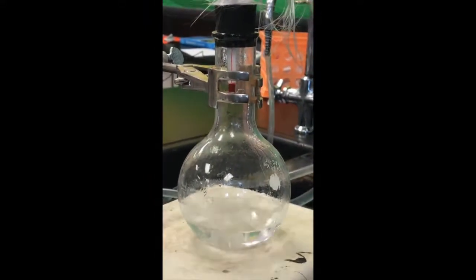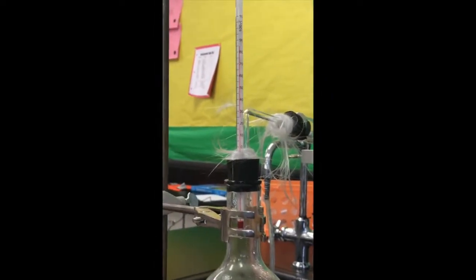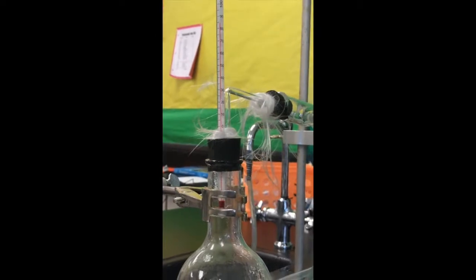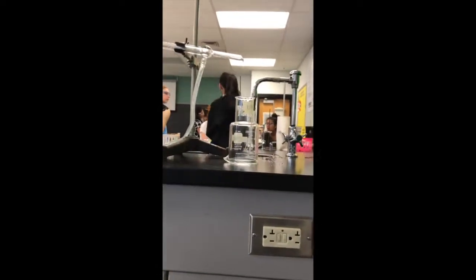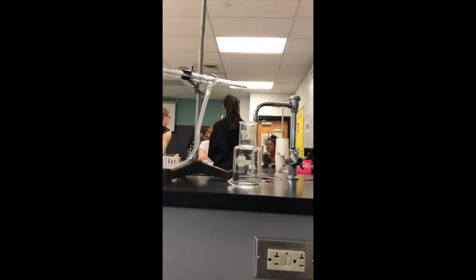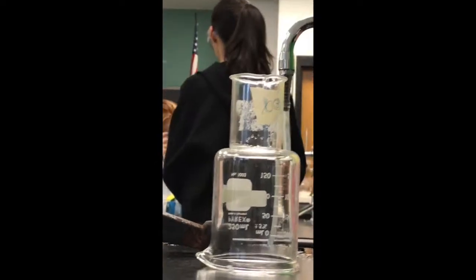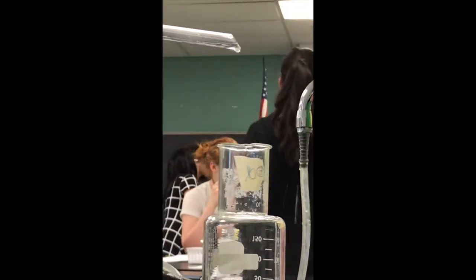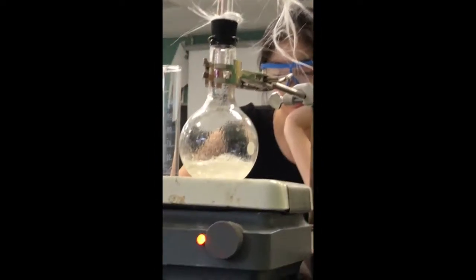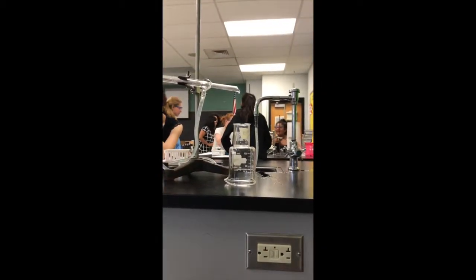We repeated this process for the 3 substances because each of their boiling points were different and they all needed to be separated accordingly. For each of the 3 substances, the distillate started to fall less frequently into the beaker, and at this point we switched the beakers so that we could start collecting a new substance.